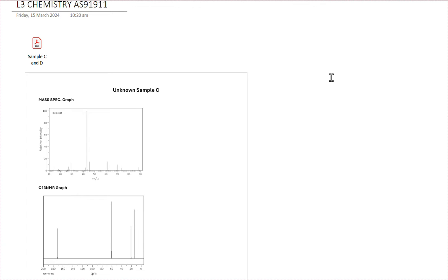Hi, Mr. T here. In this video, I'm going to look at three different spectra graphs: a mass spectra, a carbon-13 NMR, and an IR graph. We're going to use this data to identify an unknown sample, which I've called C here.